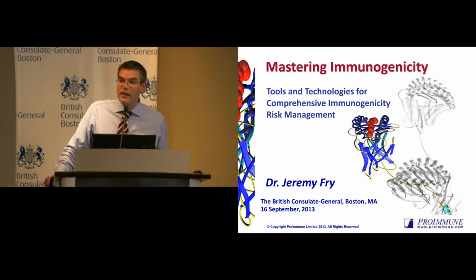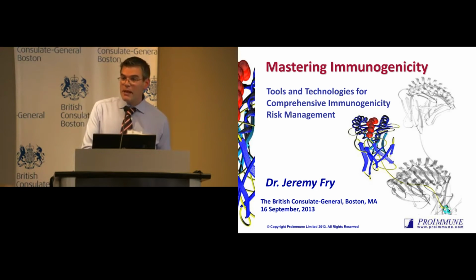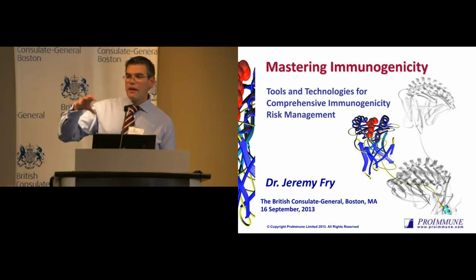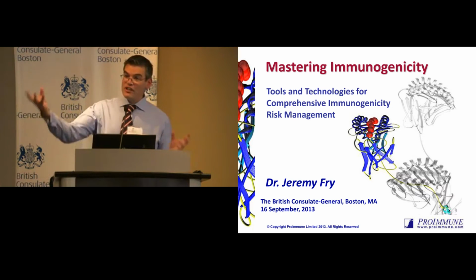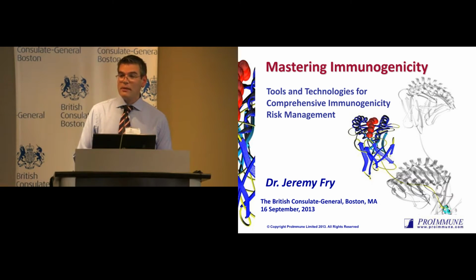There are many different ways these assays can be set up, either with whole blood assays or frozen PBMCs, fresh PBMCs. We've decided that the whole blood assay is very important because it's a very non-invasive assay. It's really just taking whole blood from patients and then adding it in. We would love to look at TGN1412, but we couldn't get hold of it in the setup we did.